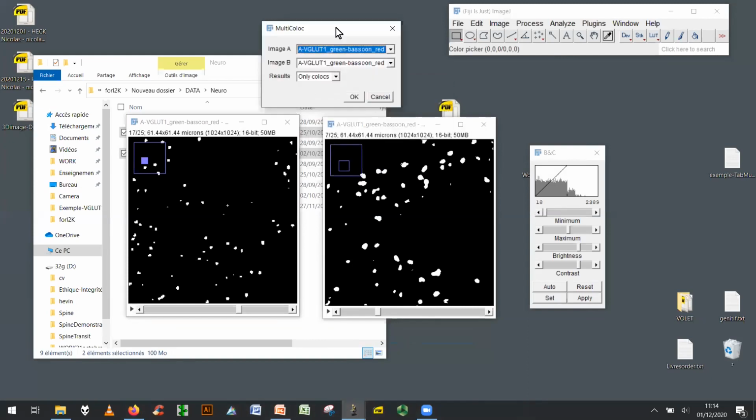Okay, so one thing, I have the habit to give long names to images, which means that here it appears as the same. So let's say this one I will give the first line, and this one the second line. I think that the problem is like ImageJ, when there is a space in the name of the image, it will just stop or cut it.